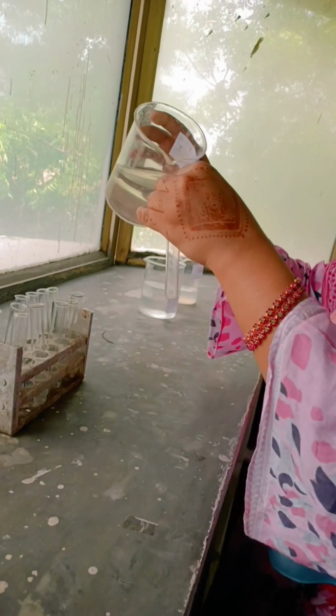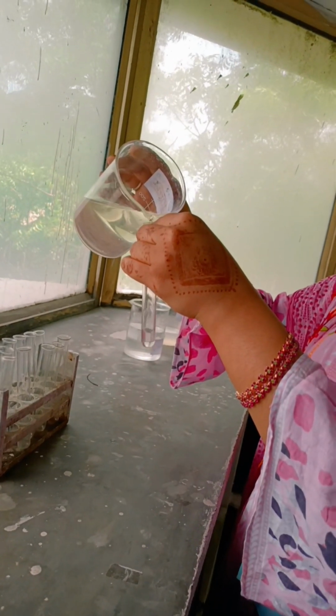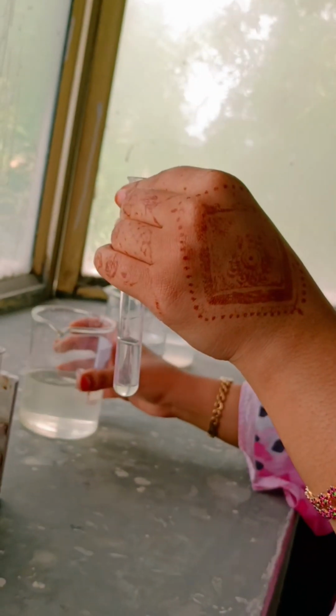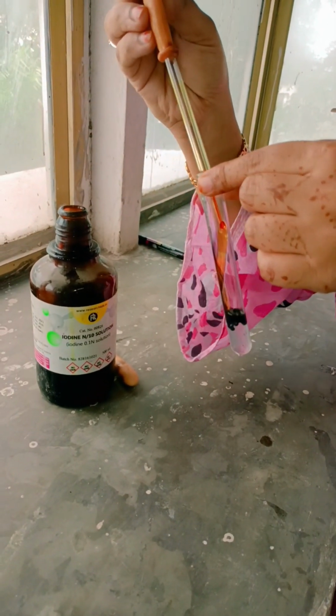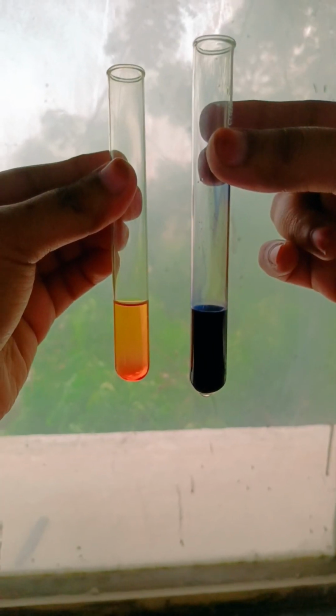Moving forward to the last test, that is the iodine test for starch. Take the sample, add iodine solution to it. If at all the sample is positive, it will turn blue, and if it is negative, it will be orange red color.